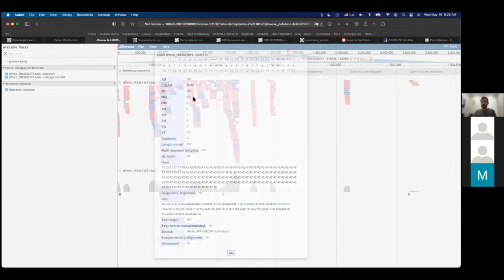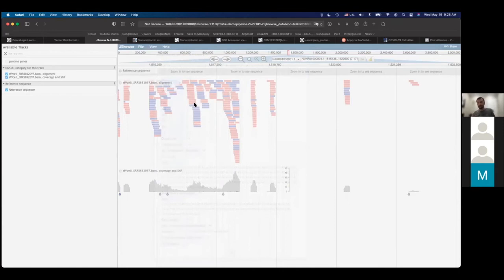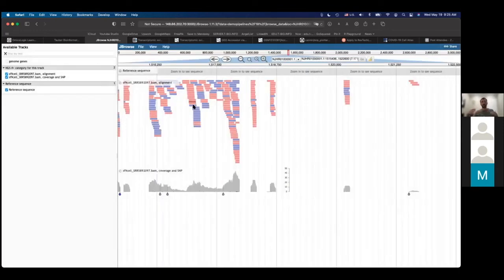Not only that, you can see that some of them are red forward and some of them are blue backward. So they are complementary sequences. They go in two directions. That gives us higher confidence in how the mapping is done, but it represents quite a significant technological challenge. And so when you think about the applications of genomics or RNA-seq data analysis tools, those are two very important trends. The development of sequencing technologies, which led to longer reads, more accurate reads, and cheaper reads. And at the same time, these computational tools that started to develop analysis methods for quick mapping.